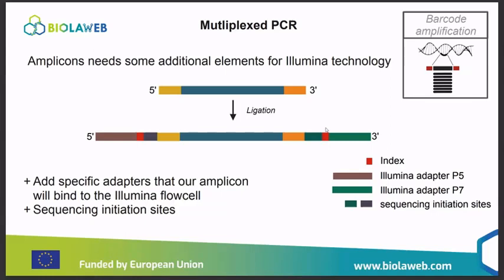Multiplexing is when we have several samples from your different lakes and different seasons, but we multiplex them together and we send them to a single sequencing run. And after that, we have to demultiplex thanks to these different indices, which are different from one sample to another. Okay? Do you have other questions?